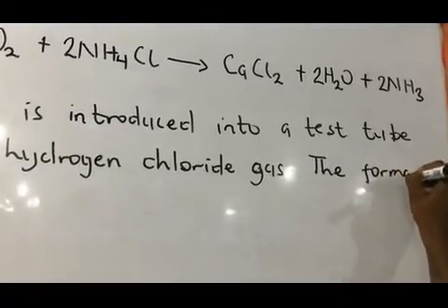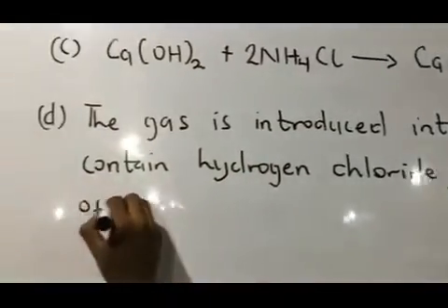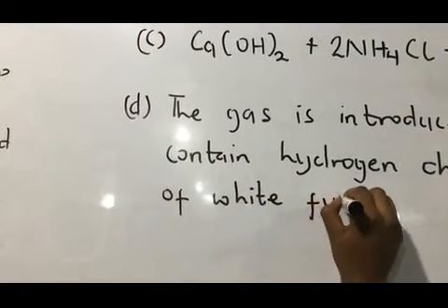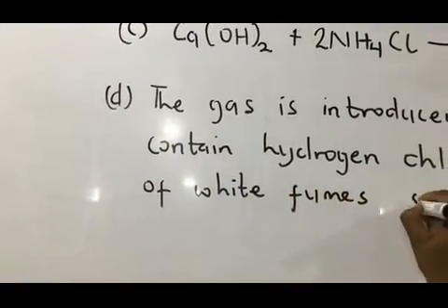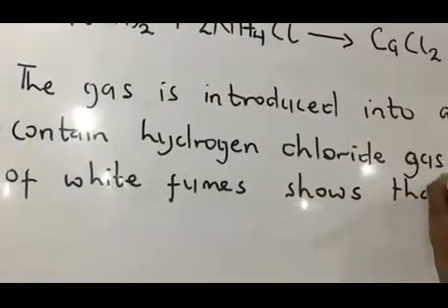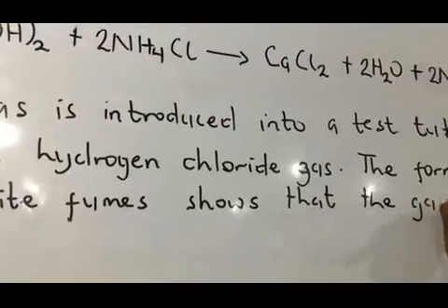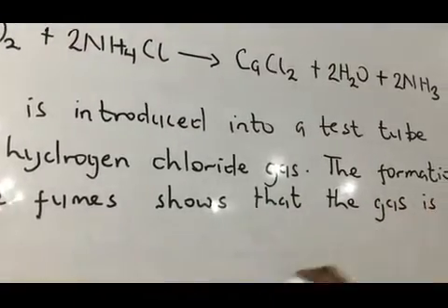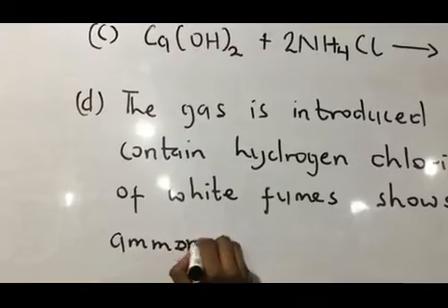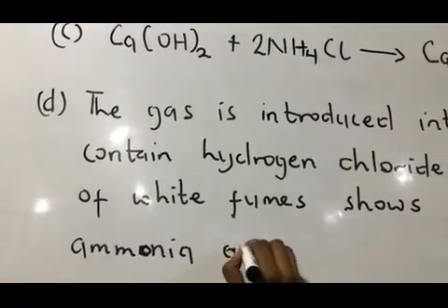The formation of white fumes shows that the gas is ammonia gas.